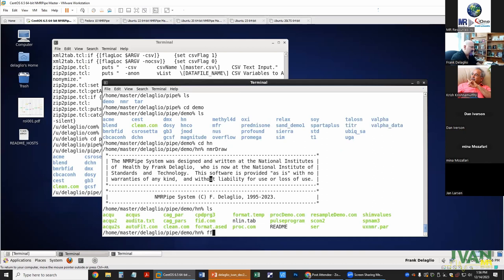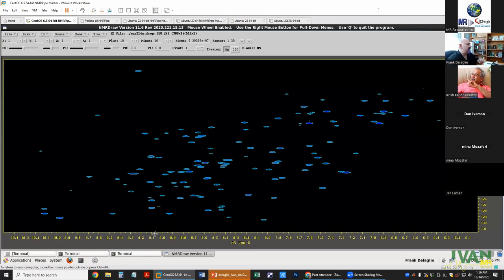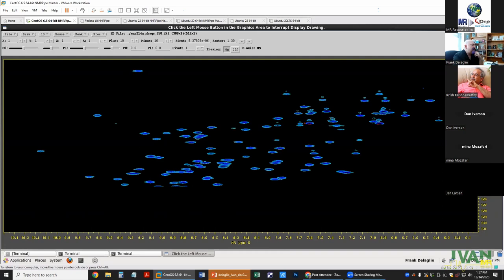Data in here. All right, so here's our example spectrum. And you'll notice that the top border of the program has some messages about what kind of things the mouse can do. And for 2D and 3D and 4D data, by default, when nothing else is happening, if you move the mouse pointer out to the outside border of the program and move the scroll wheel, I can increase or decrease the contour levels. So I'm doing that with the scroll wheel right now, scrolling up and scrolling down.